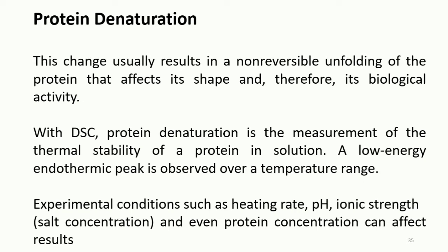The temperature of the peak actually provides information about thermal stability, and the area of the peak is a quantitative measure of the energy absorbed by the protein in order to change structure.